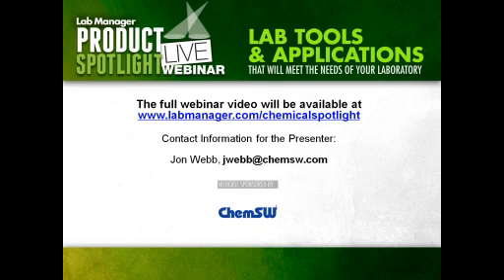Sure, that's a fantastic question. It's my experience, and I've been on site at a few organizations that are tracking very, very small vials, that they simply leverage a plastic baggie. They'll put the contents, or maybe just a small vial, inside the plastic baggie and put a barcode label on the outside of that baggie. It seems to work really, really well. Yeah, that's a good and straightforward solution.